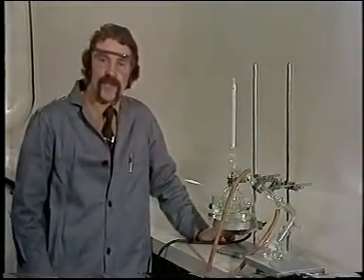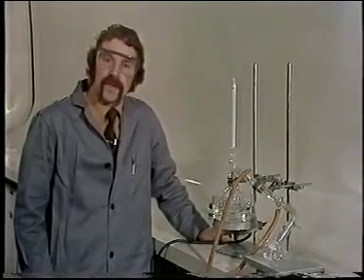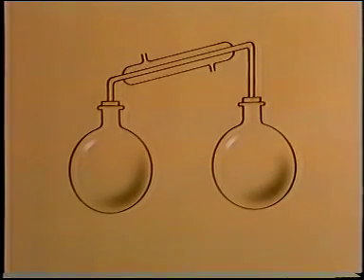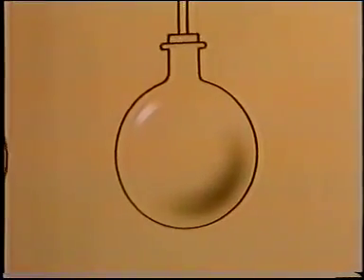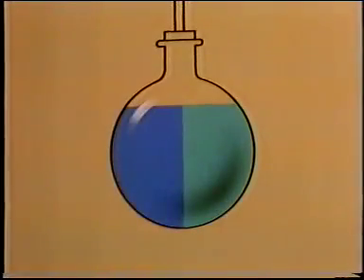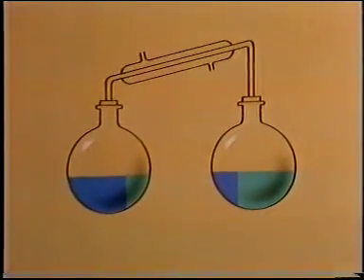Again, we have to ask the question, how is it that distillation brings about purification? The theory of purification by distillation is more complex than that of purification by recrystallization. Let's take a mixture of equal volumes of two liquids which have different boiling temperatures. We now heat the mixture and distill off about half of it.